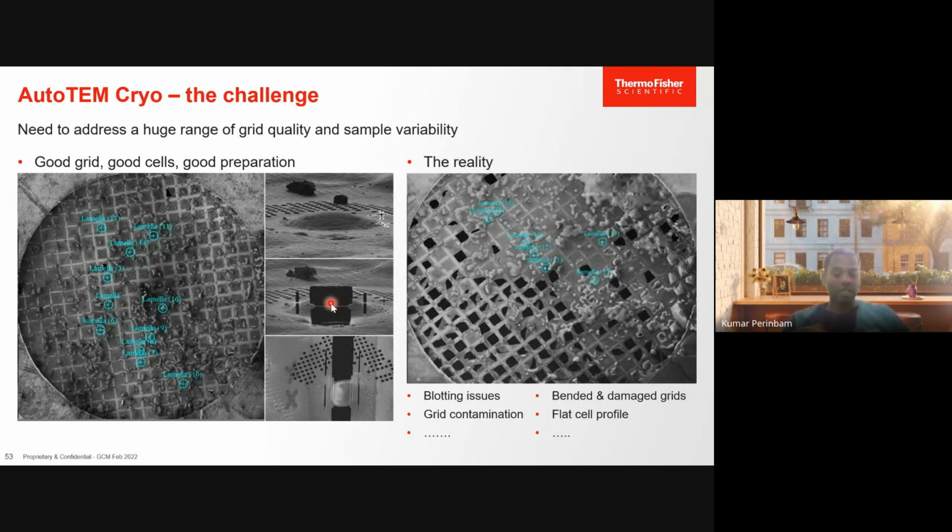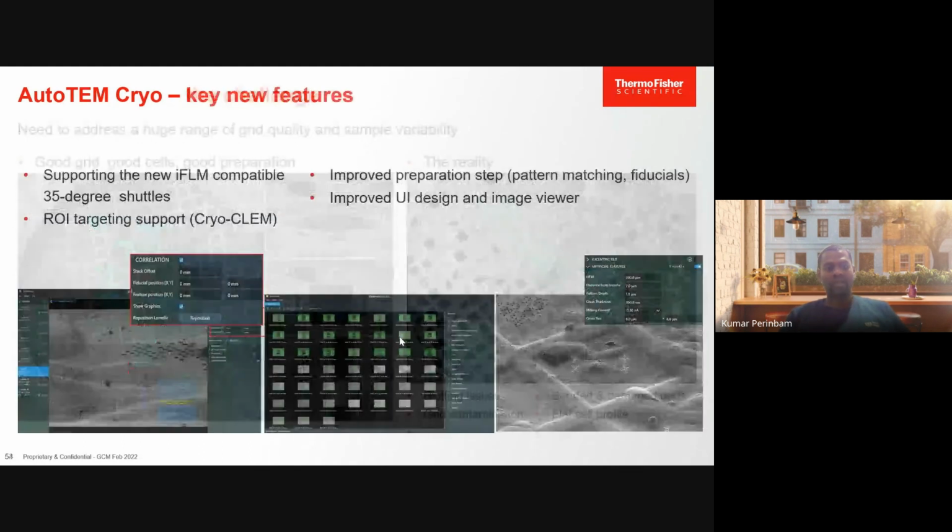Plasma beam is where you take a gas and pass it through a very high electric field, so it gets charged and the plasma is formed. And then once you focus it on a tissue without spoiling the tissue's integrity, it will etch away the entire sample and leave you with a thin film, a lamella.